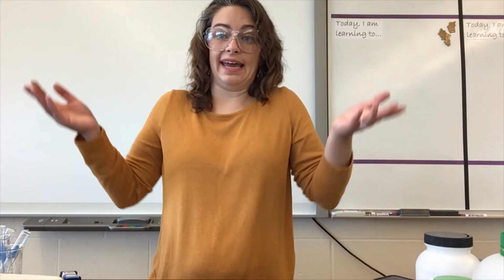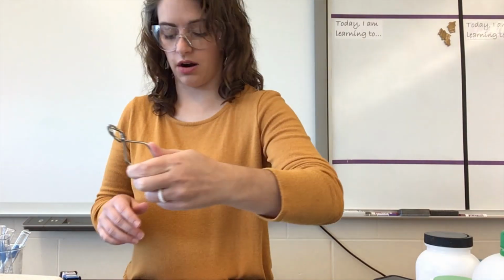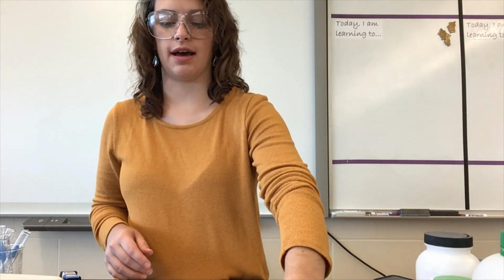Well, it's been about a minute and it's not doing anything. So it is not likely to melt. So we are going to say that sodium bicarbonate has a high melting point because it is definitely not melted.